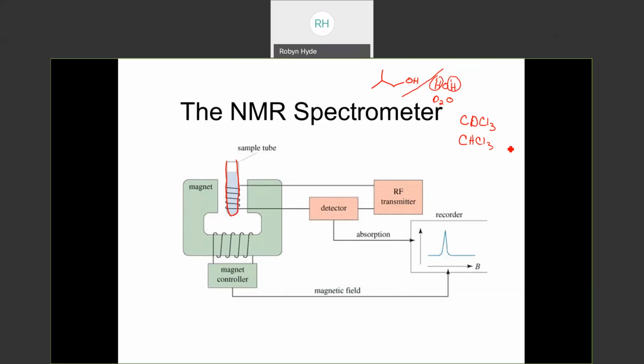The downside of that is that it's not a good solvent for everything. Sometimes you are going to see little bits of solid still within your NMR tube, but we've figured out concentrations that work for us. If we have a compound that really just won't dissolve enough for our analysis, then the go-to is deuterated methanol. So we do have some deuterated methanol around.